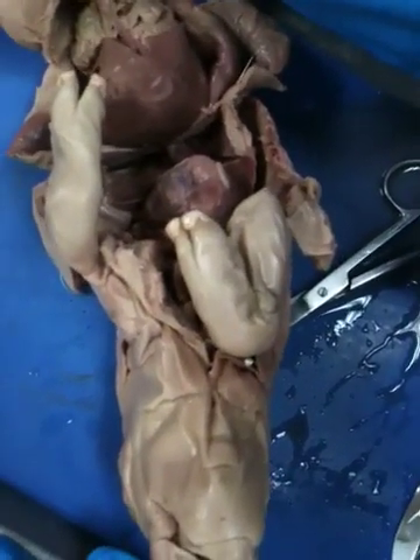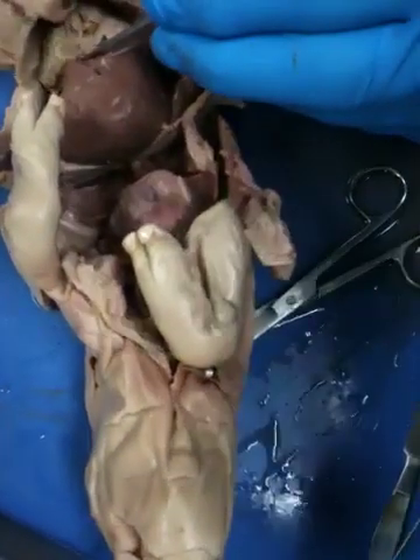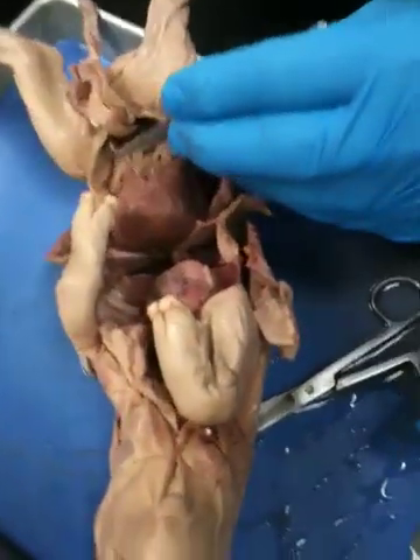Belly button. It is a belly button. I'm sorry — it's an internal belly button. The belly button is all the way out there. Internal.